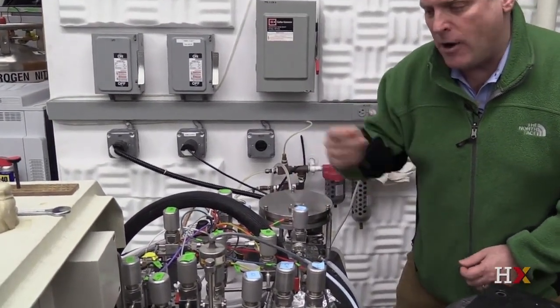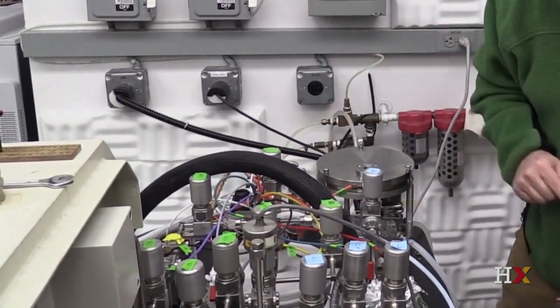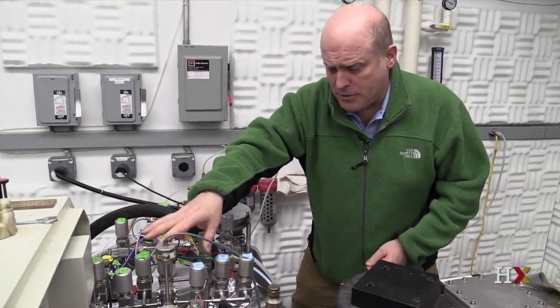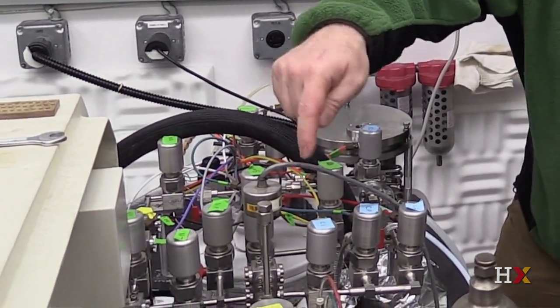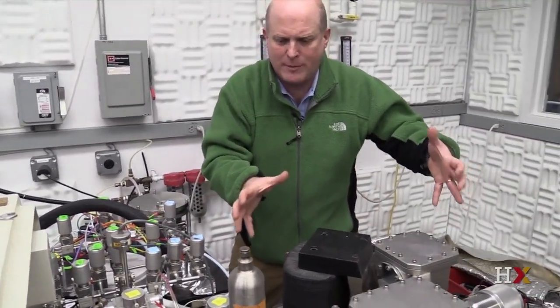That's what's happening right now. There's liquid nitrogen flowing through this cold finger and cooling it down while it traps the carbonate sample. After the CO2 is transferred over here, the valves behind it are closed, the cold finger is warmed up, and then the carbon dioxide is emitted over here, and this is the main part of the instrument. This is the mass spectrometer.